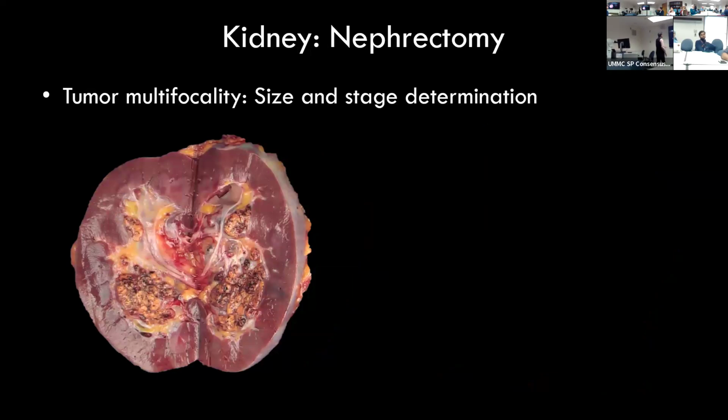So there seems to be a distinct nodule right there, which seems to be at a fairly longer distance from the main tumor. So most people will try and measure or describe these two as, okay, I see one distinct large mass, which measures whatever, 5 centimeter, and then another mass, which is 2 centimeter away from the main mass, which measures about 1 centimeter or 2 centimeters. Okay, so that's not correct.